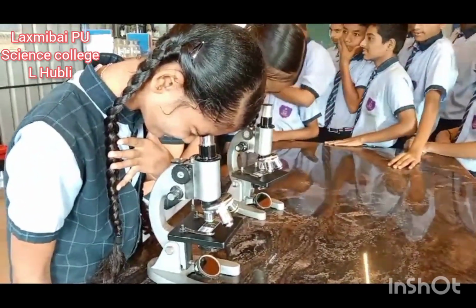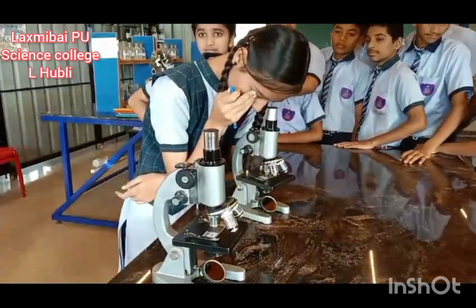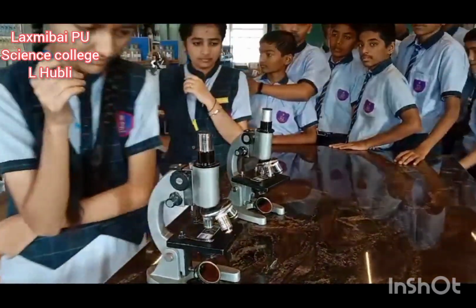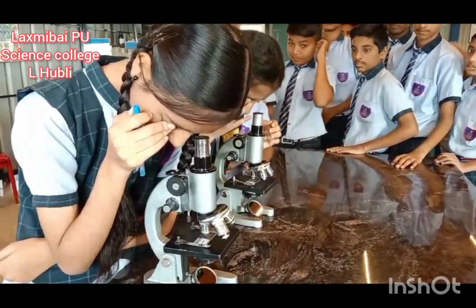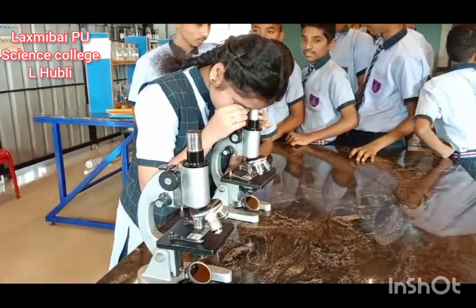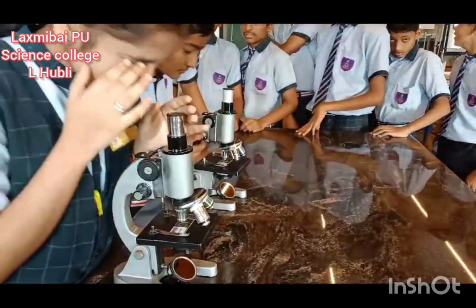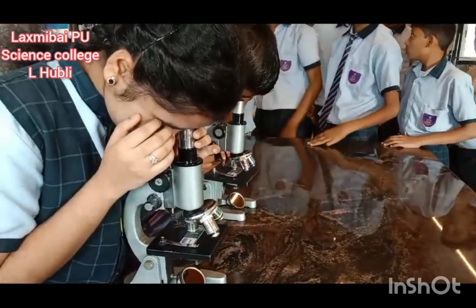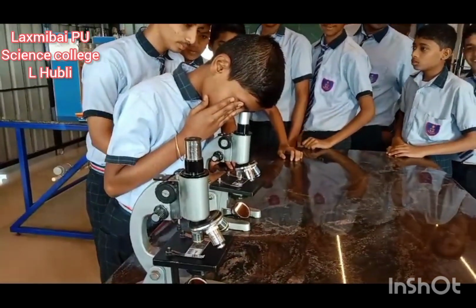If you are unable to observe, do fine adjustment. That's what I am telling. If you are unable to see, you need to do fine adjustments. The small one. And one more thing, whenever you are observing under microscope, you need to take your time to observe the organism. You need to take time and observe.